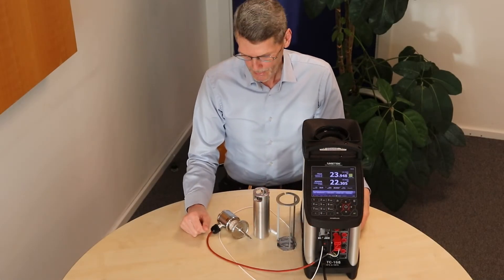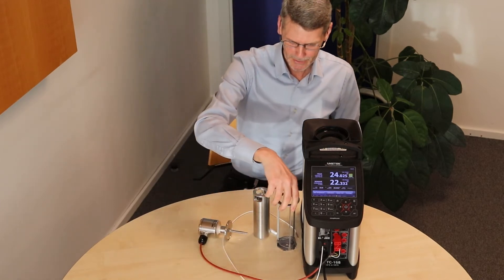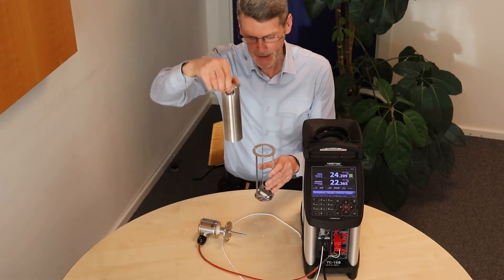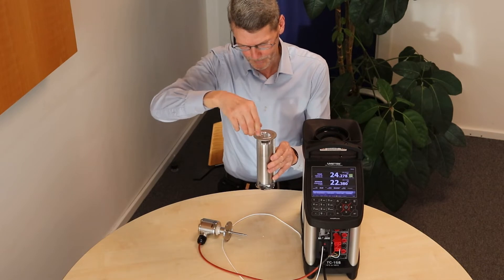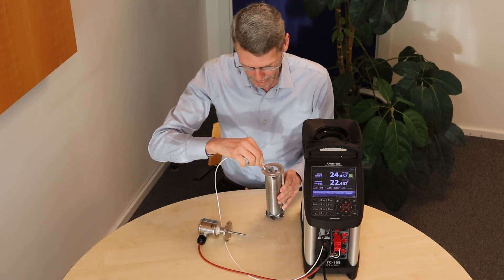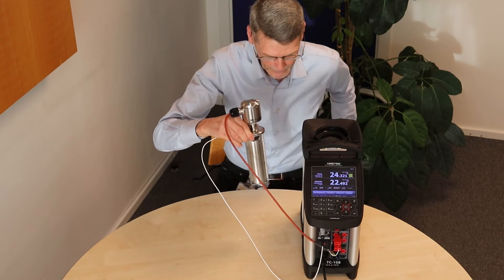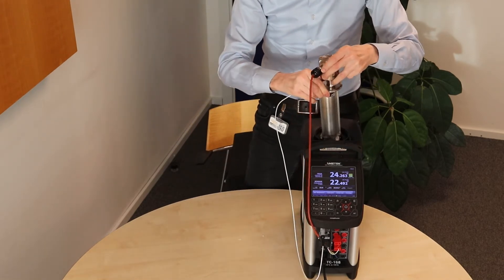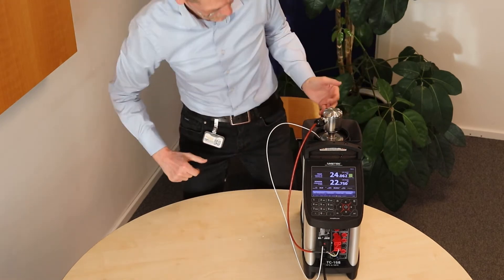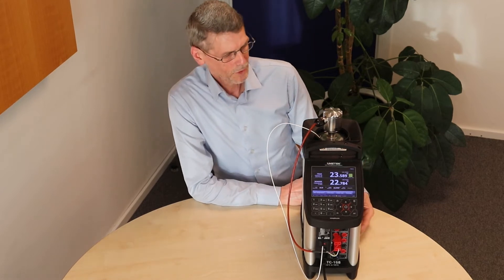Method number three: calibration of a sanitary sensor in a bath. What we need is a sensor basket, a steering magnet, and then the patent pending heat conveyor placed in the sensor basket. The reference sensor is put in to a fixed position, and then the sensor under test is mounted. We put the system in the calibrator. With the heat conveyor, the sensor is in a fixed position, giving you high repeatability when you calibrate next time.